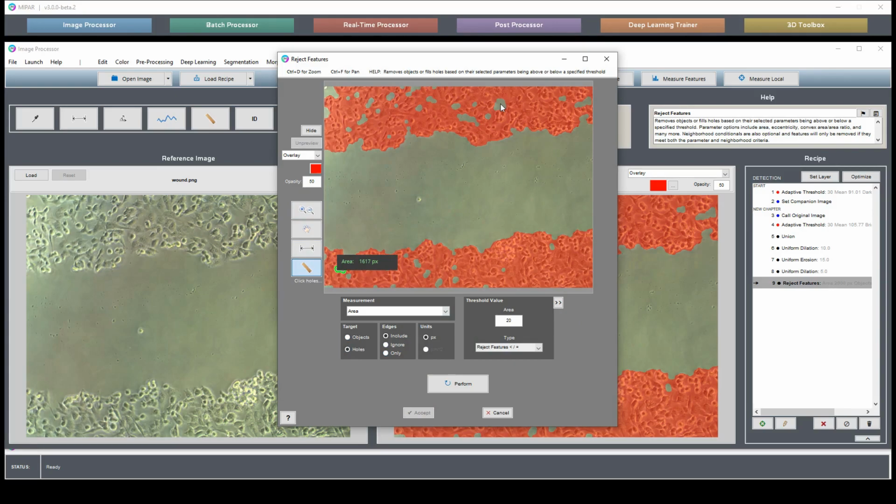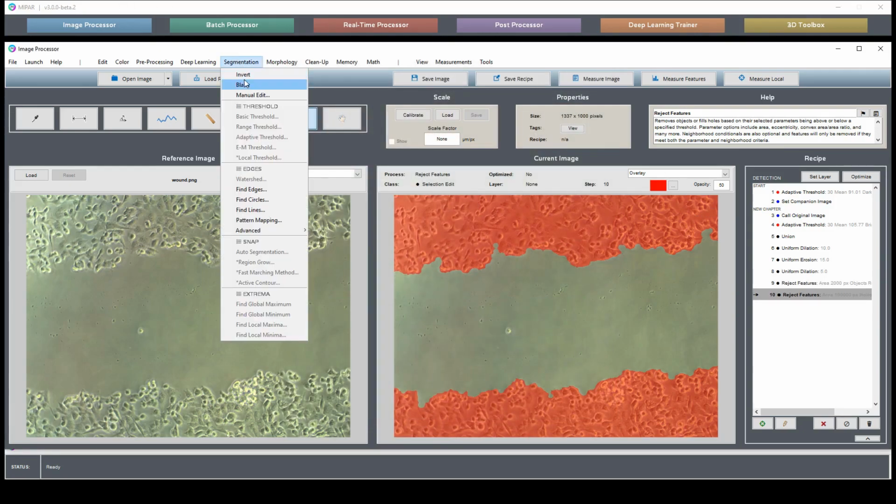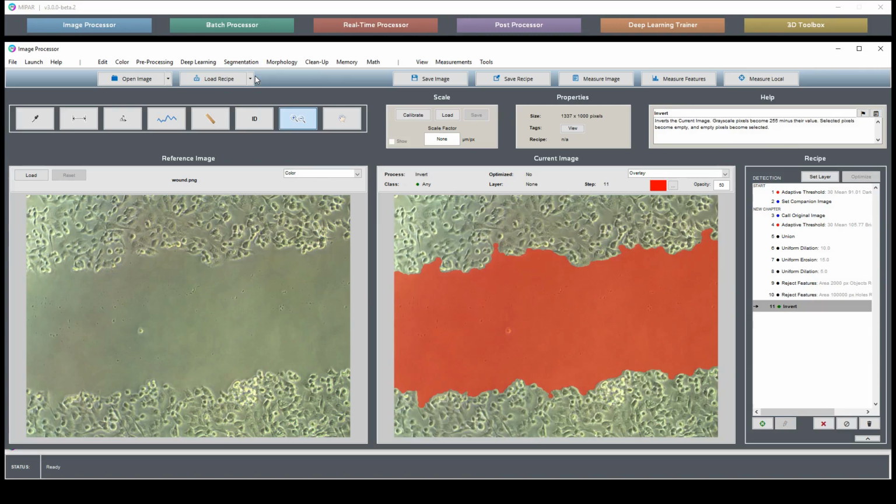So these guys here, inside the segmentation, are a couple thousand. This guy is 700,000, the wound in the middle. So if we set our cutoff at 100,000, and here we have our wounds selected.